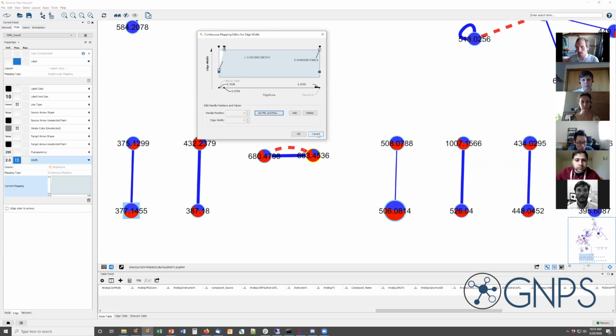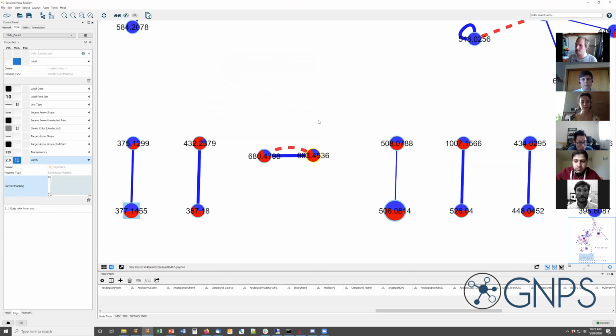Ideally, and that might be something for Ming, or an issue to make on our GitHub, would be to separate those scores into two columns. Okay, good. Thank you.